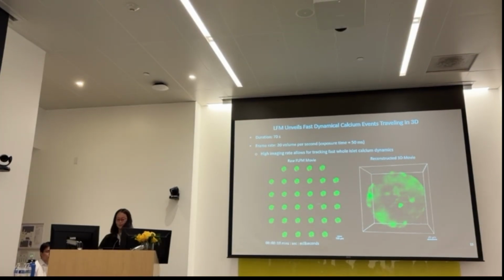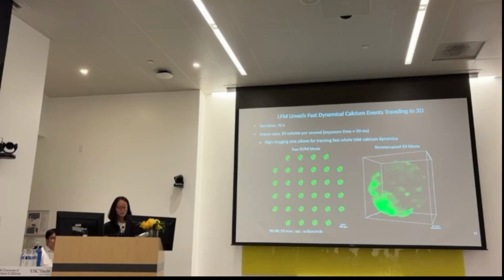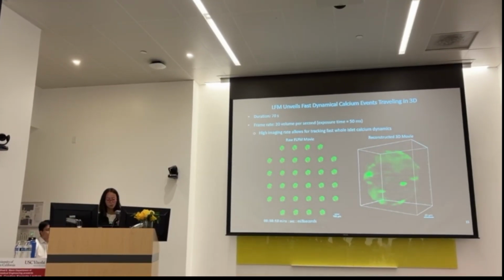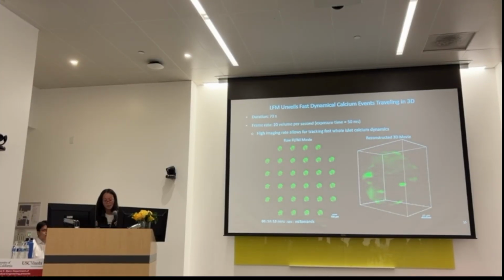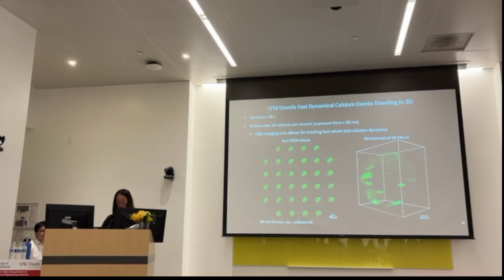So for this experiment, we recorded 70 seconds with frame rates at 20 volumes per second. And as we can see here, with the high volumetric imaging rates, we were able to track these really fast calcium dynamics traveling across the whole islet in 3 dimensions.